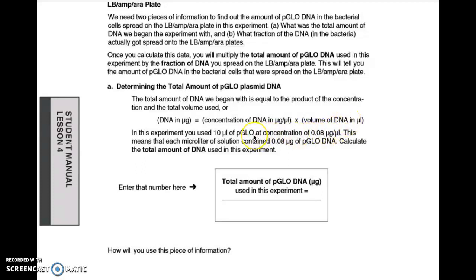Now W2, if you recall, you used the yellow inoculation loops to move a film of DNA to your plus pGLO microcentrifuge tube. Most of you used the green microcentrifuge tube to show plus. Some of you used red. So we're going to estimate that the film on your loop was 10 microliters. In W3 and W4, we changed the procedure slightly, and we actually used the micropipetters, adjusted to 10 microliters. So everyone's going to use the same value. So that's the total volume of DNA that you used in your plus pGLO treatments.